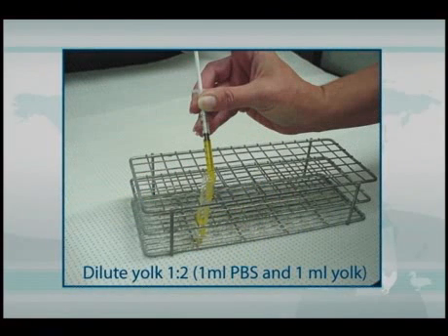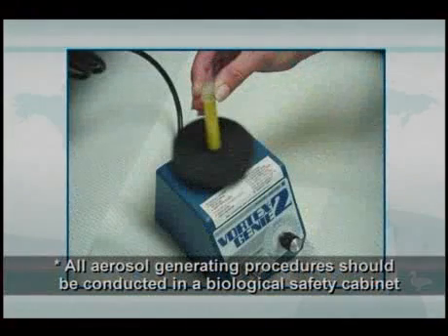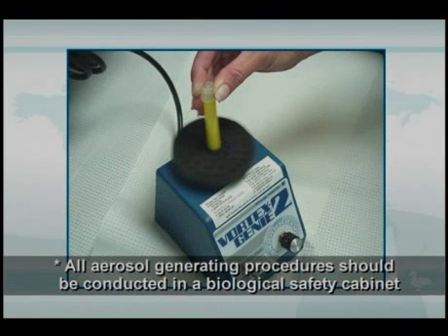The processing of this yolk is simply to dilute 1 to 2, or 1 part PBS, 1 part yolk, and then vigorously vortex this 3 or 4 times over a period of about 1 hour. Then they can be centrifuged at 1500 times G for about 30 to 45 minutes to get a nice translucent layer in which the antibodies will be present. This can then be used as the equivalent to undiluted serum.